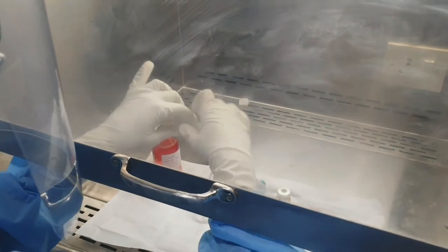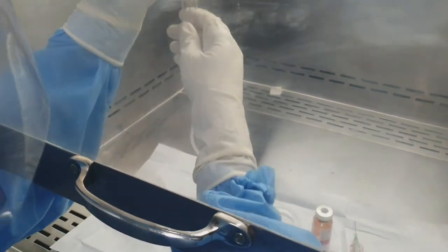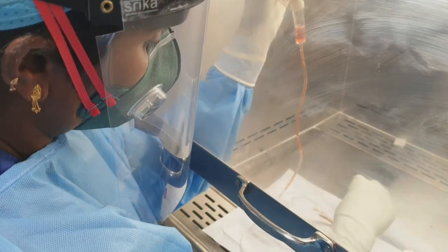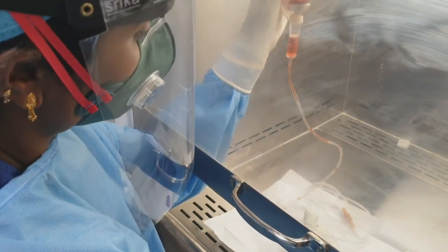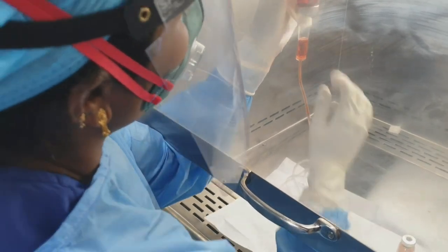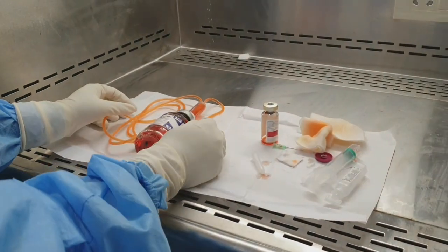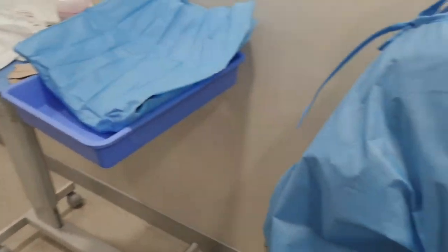The priming of the IV set is done inside the laminar hood. You freely let all the chemotherapy flow into the IV set, which will be ready to connect to the patient. The priming of the IV set along with Daunorubicin is done. Now we will keep the product in the sterile container — the sterile drape is ready, so we will keep it safely and cover it. Then we will see how to dispose of the chemotherapy agent.